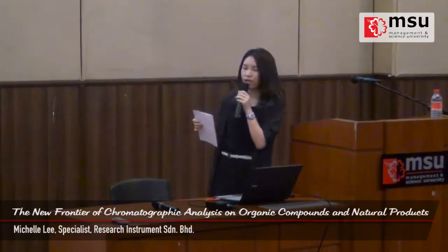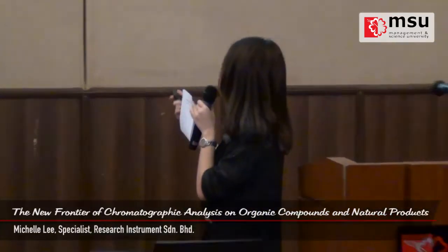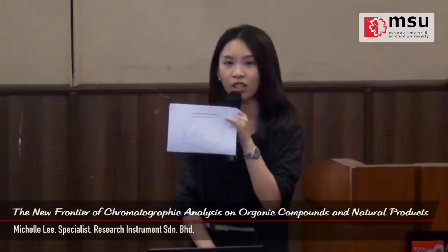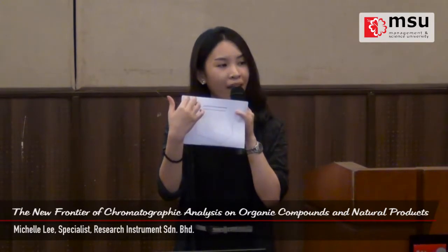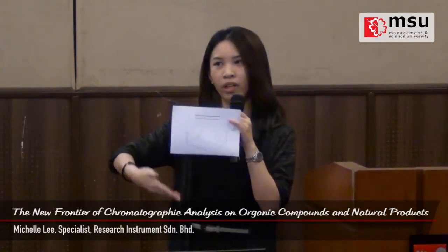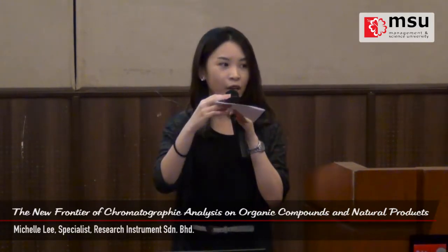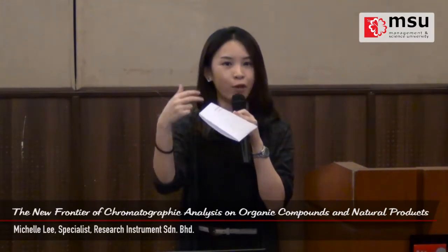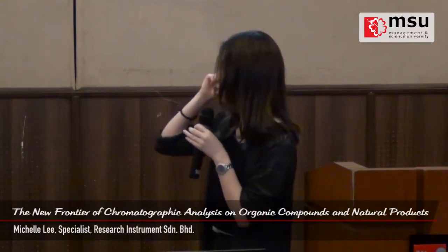Usually for TLC plates, we only spot at the bottom and then do the development, okay? But how these 72 samples happen is that we are going to spot at the bottom as well as spot at the top. And then instead of this vertical development, the plate is placed horizontally, and a two-way development occurs simultaneously from both sides. Therefore you can accommodate more samples. Okay, so this is just one of the development chambers that we have.